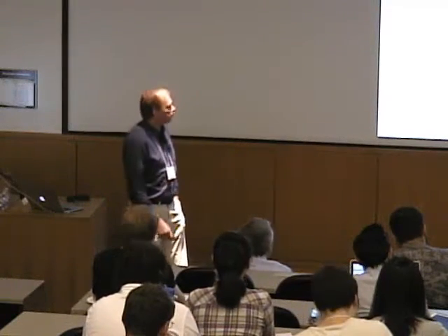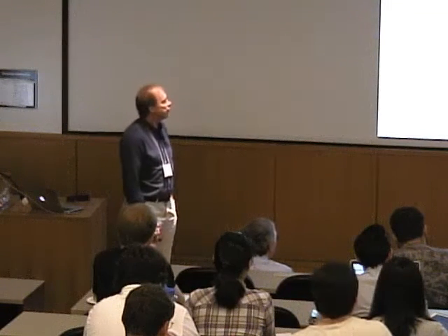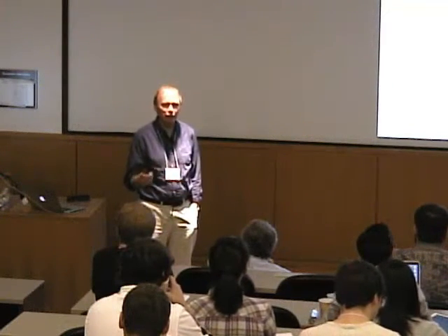So what we're going to do this morning is, of course, talk about EPR. My goal here is to give you hopefully a little bit of introductory understanding of how the technique actually works and why EPR spectra look the way they do in general. I've seen over the years that many chemists use EPR but have a somewhat vague understanding of why the data they're looking at look the way they do. So if I can help in some way to clear some of that up, then we'll have achieved our goal here.